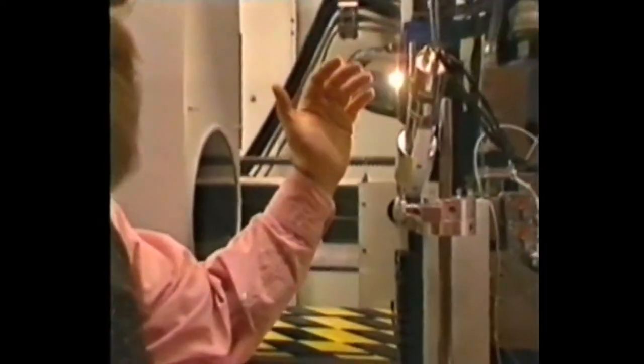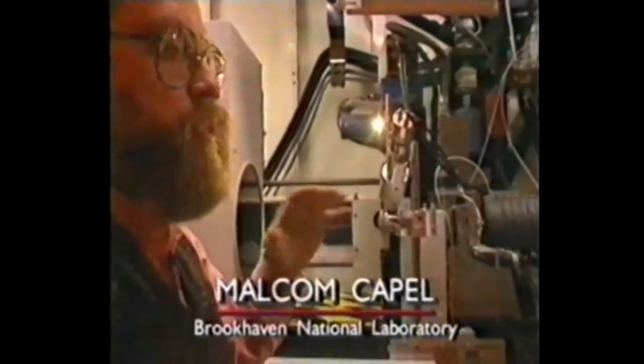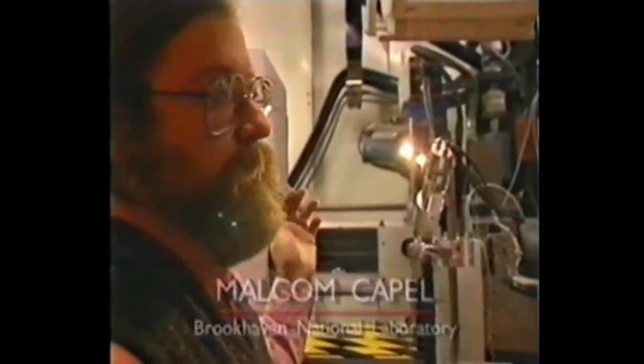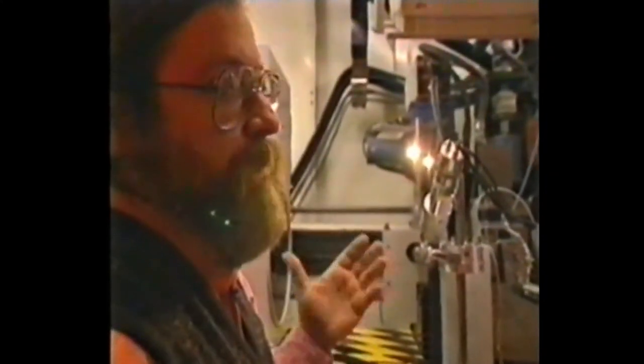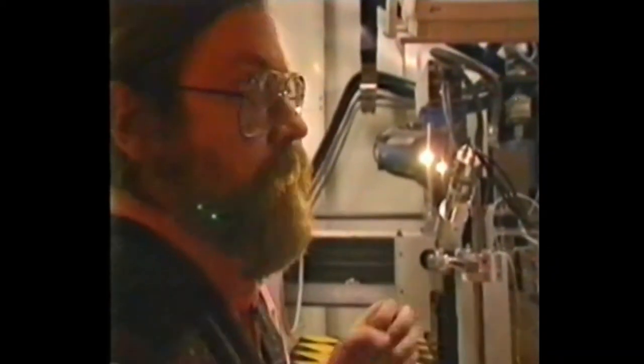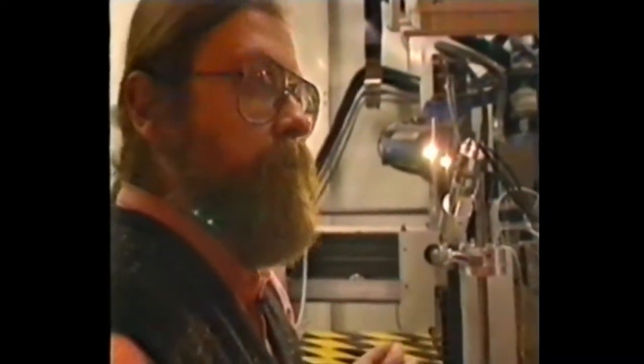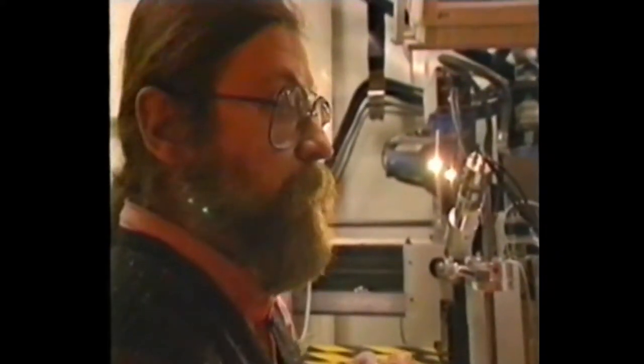So in practice, what we do is we mount a small crystal here, align it to the beam optically. We have a little visualizer here that facilitates that. Then we rotate the crystal at a fixed rate, acquiring short exposures over small angular displacements, and then record a series of diffraction spots on the image plate detector, scan them out, record them to memory, and then later on they're analyzed in terms of indexing the reflections and measuring the intensity of the scatter spots. And from that we can reconstruct the three-dimensional electron density within the crystal and in effect the atomic positions of all the atoms within the protein molecule.